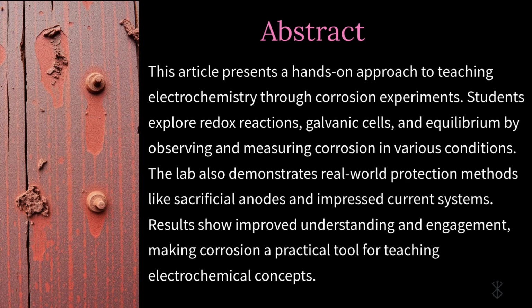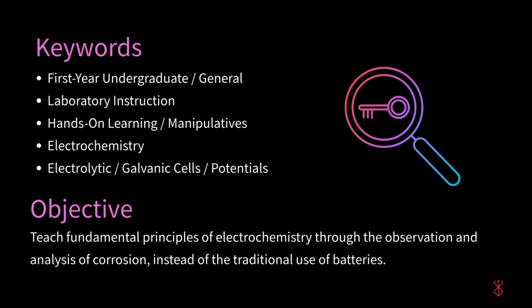The lab setup is cost effective, simple, and highly relevant to engineering and military application. Educational results showed improved student performance and engagement, particularly when the lab followed an introductory battery activity. The objective of this experiment is to teach fundamental principles of electrochemistry through the observation and analysis of corrosion instead of the traditional use of batteries.